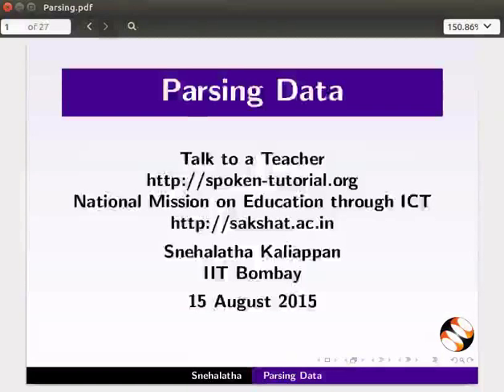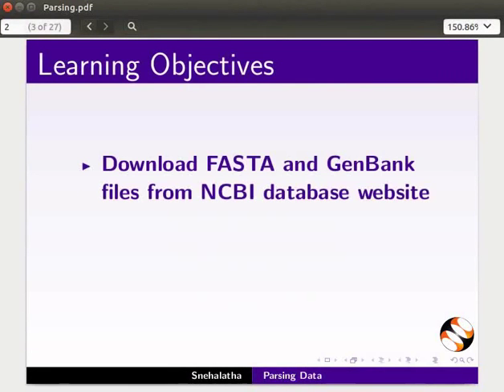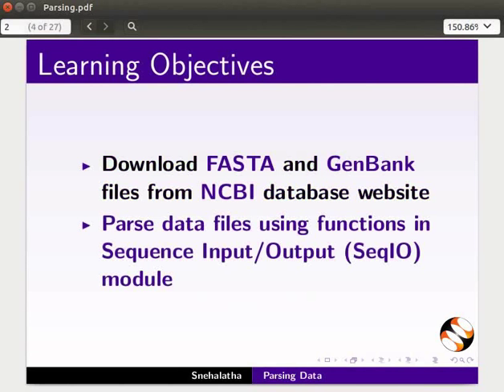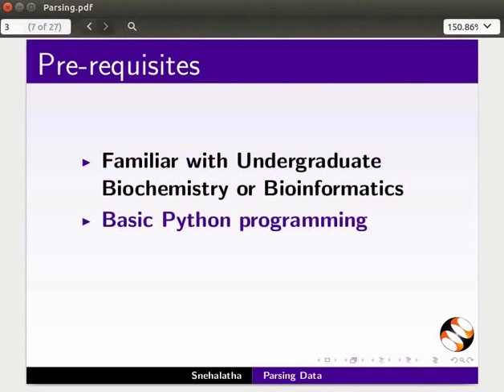Hello everyone, welcome to this tutorial on parsing data. In this tutorial, we will learn to download FASTA and GenBank files from the NCBI database website and parse data files using functions in the sequence input-output module. To follow this tutorial, you should be familiar with undergraduate biochemistry or bioinformatics and basic Python programming.